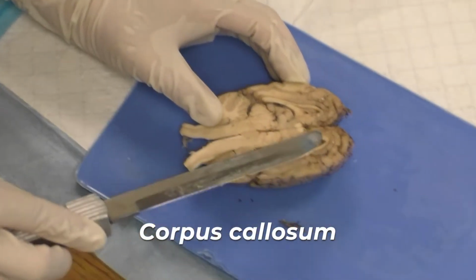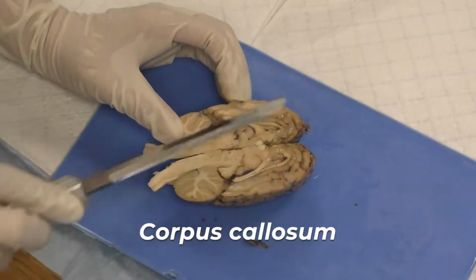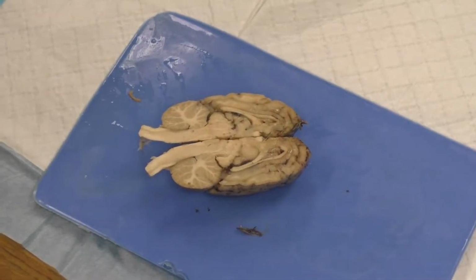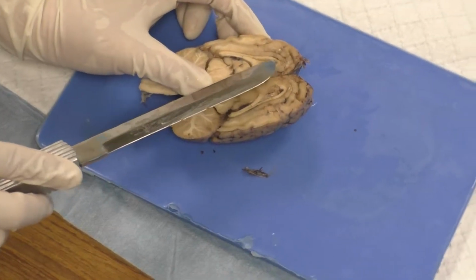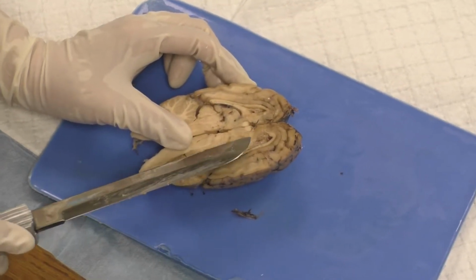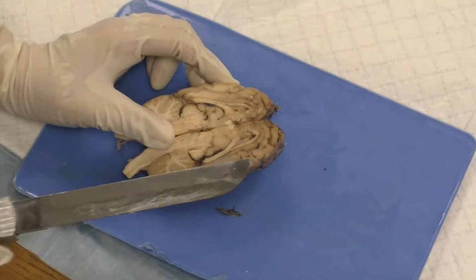The corpus callosum is the fiber pathway that links the cells from this side of the brain to that side of the brain, so there's great interaction. It looks even bigger in the human brain. I can't cut this open, but it's there, it's prominent, and it's floating on top. But then you can see this offshoot diving down here. That is the fornix.